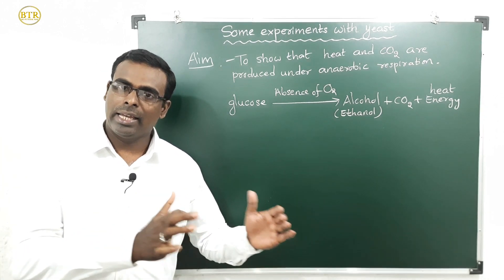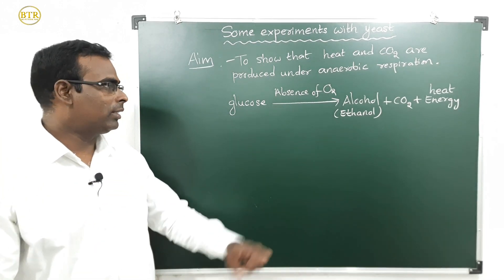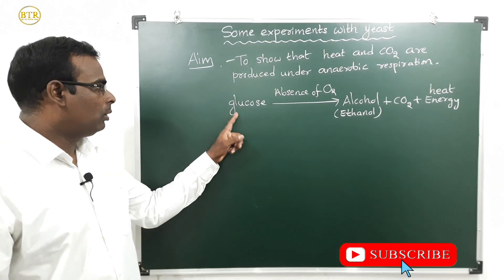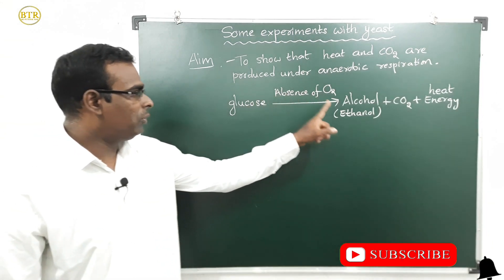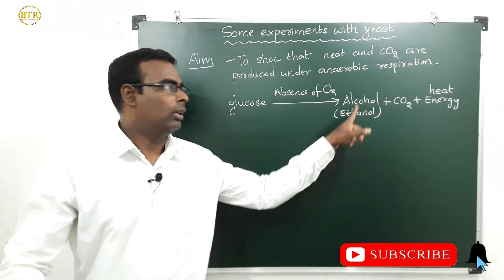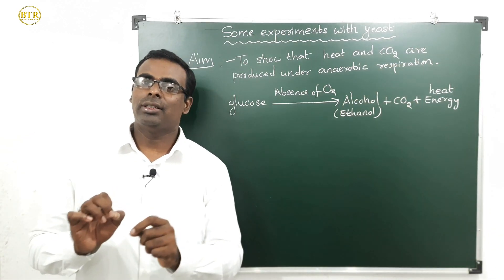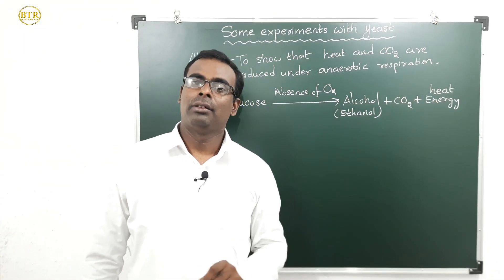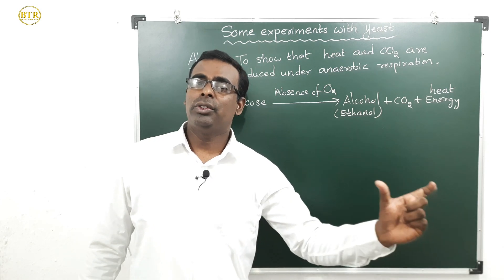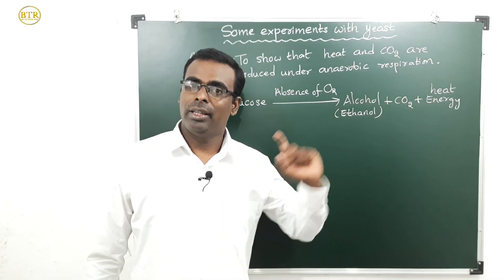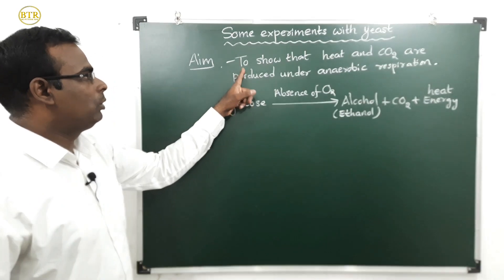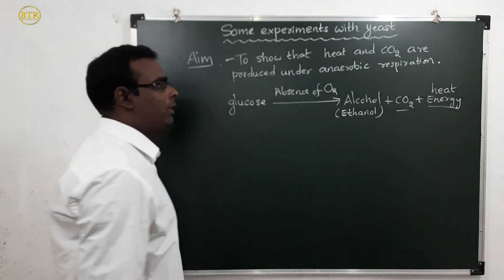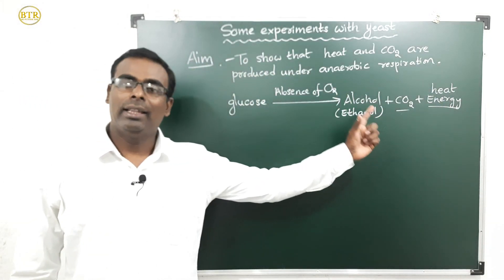So in anaerobic respiration, glucose breaks down in the absence of oxygen to produce ethanol, carbon dioxide, and heat energy. Carbon dioxide and heat energy are produced in anaerobic respiration — and that is exactly what we are going to prove in this lab activity.